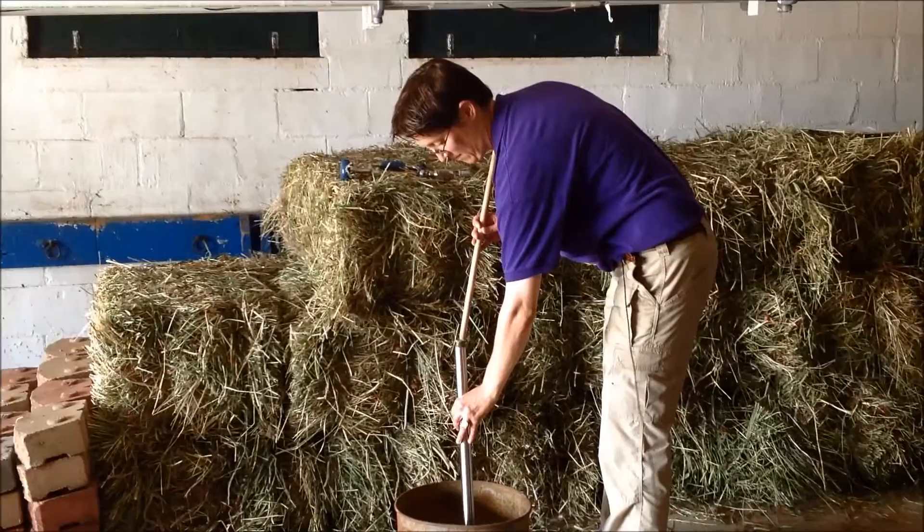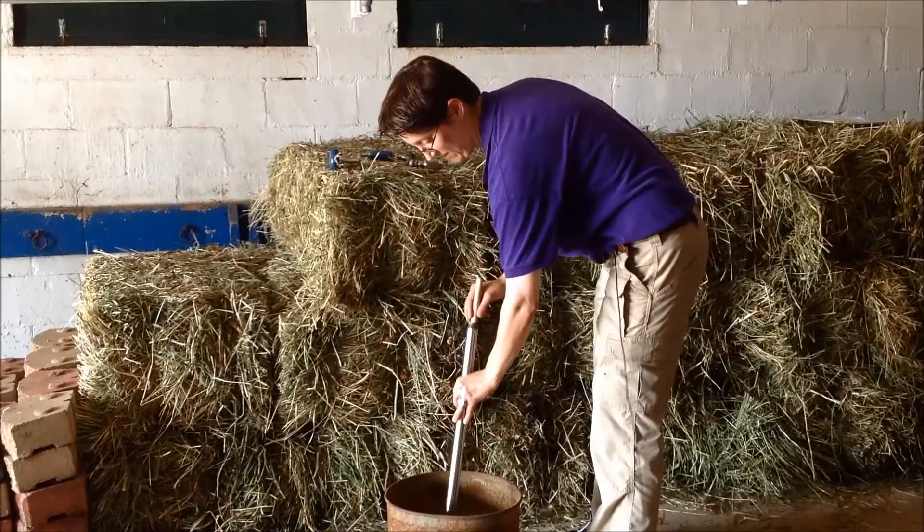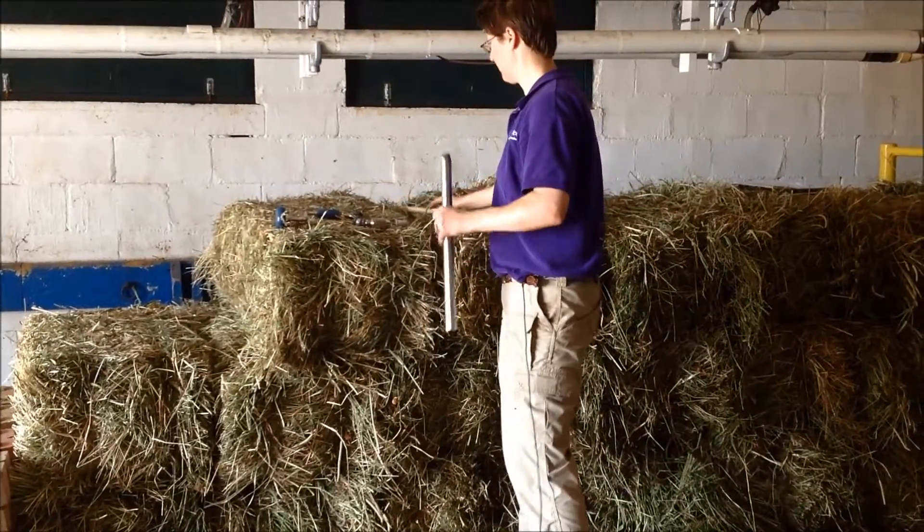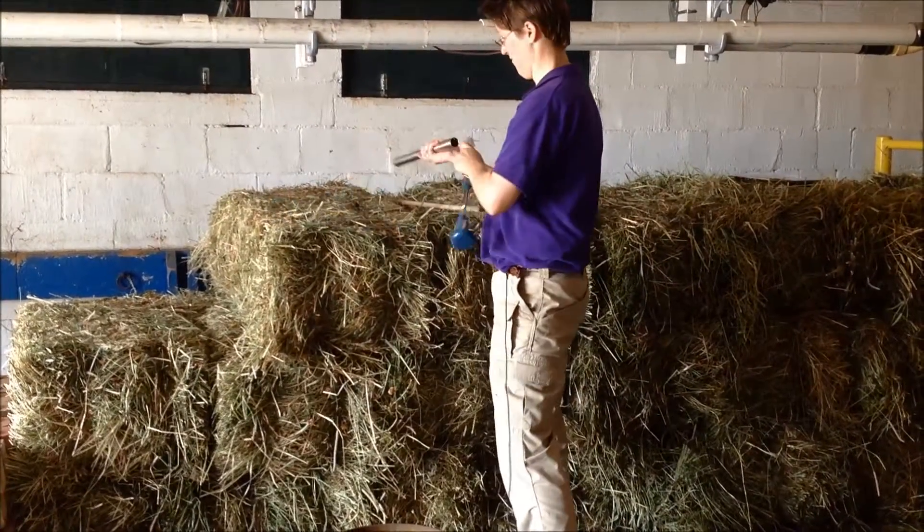Round bales should be sampled perpendicular to the circumference of the bale. Using a core sampler is better than taking a grab sample because it causes less separation of leaves and stems.